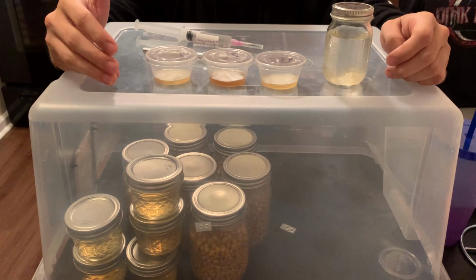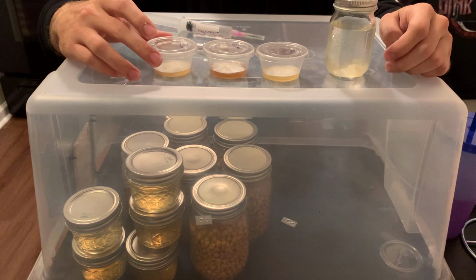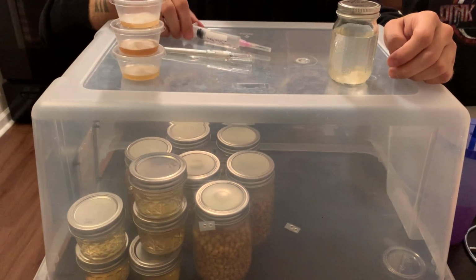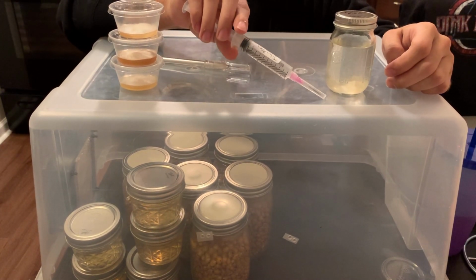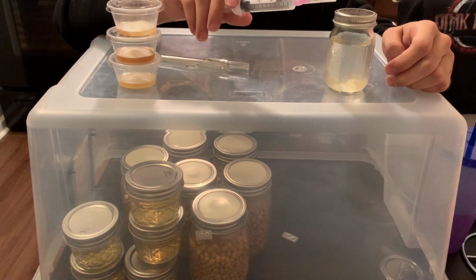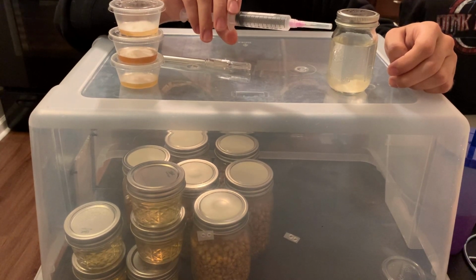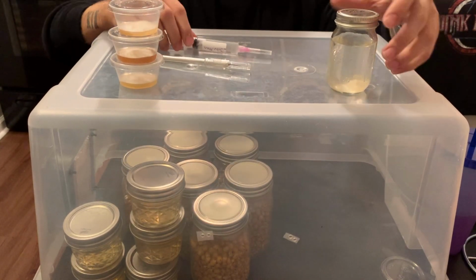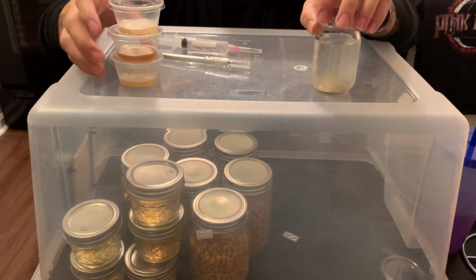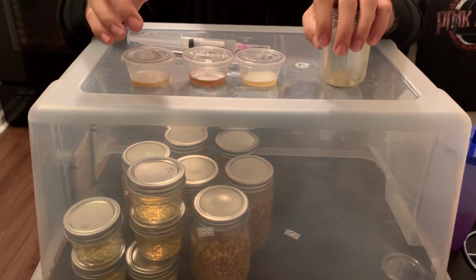Okay, now that our jars and our liquid culture jars have cooled, we're gonna go ahead and inoculate. There's a couple different methods here. You could use agar. As you can see, I have a couple different cultures here that are ready. You could use a spore syringe, which is probably what most of you are gonna be using. A good place to get some spores is you can check out the verified vendors list on the Spore Traders Reddit, or if you have this established, you can use a liquid culture as well. Today I'm going to be using some of my established cultures, so I'm going to show you guys how this is going to work.